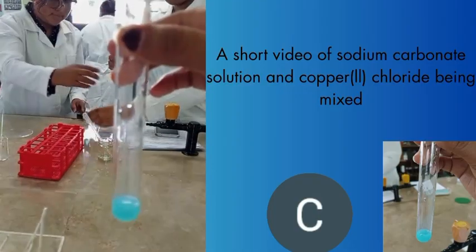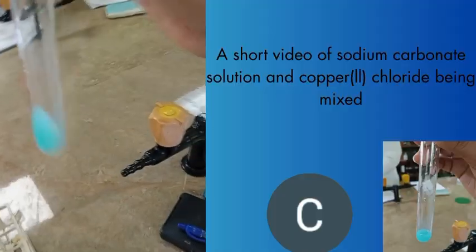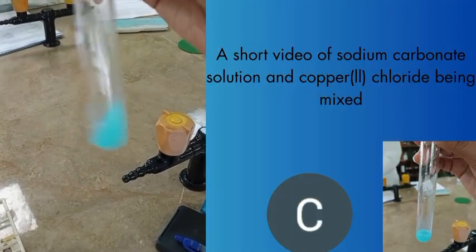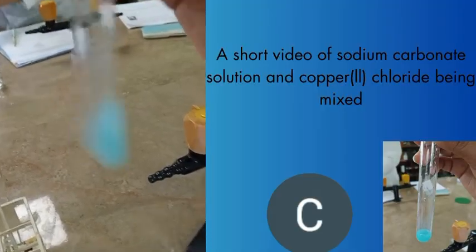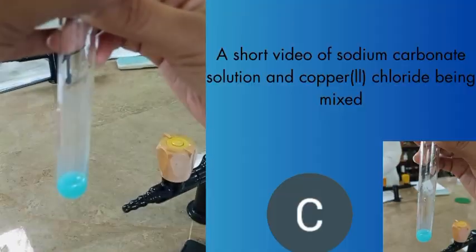So here we have a short video of sodium carbonate solution and copper 2 chloride being mixed. And for a little background explanation, the reaction is a double displacement reaction between copper 2 chloride and sodium carbonate.